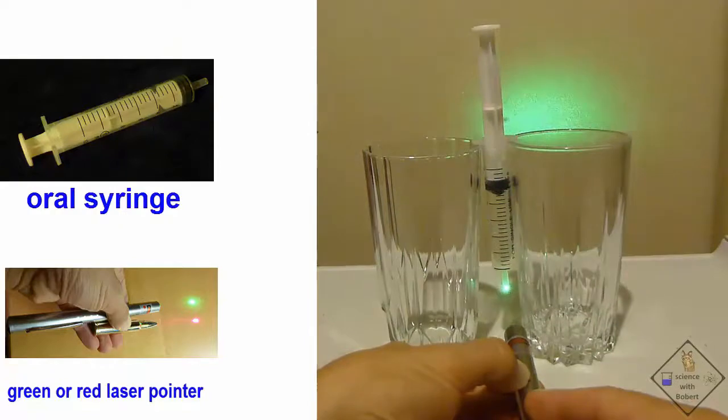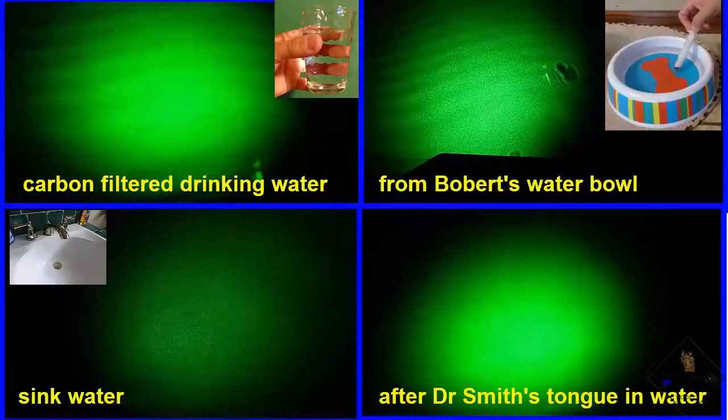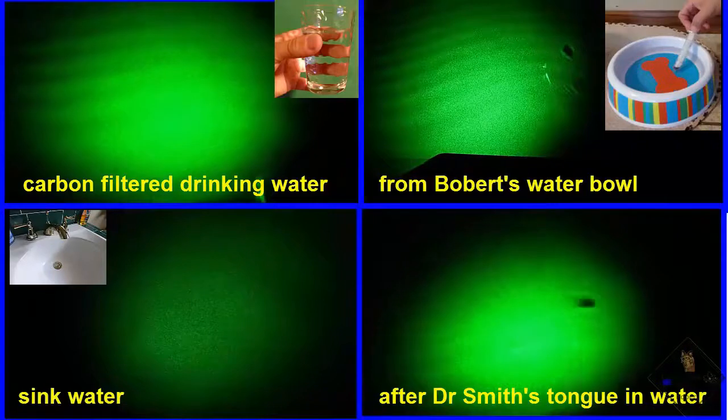The hanging drop acts like a lens for the laser light to pass through. Microbes in the water droplet block the laser light, and what you see projected onto the wall are the shadows of single and multi-celled microbes inside the droplet. Crazy! Dr. Smith and I did a few experiments, and here are our results.